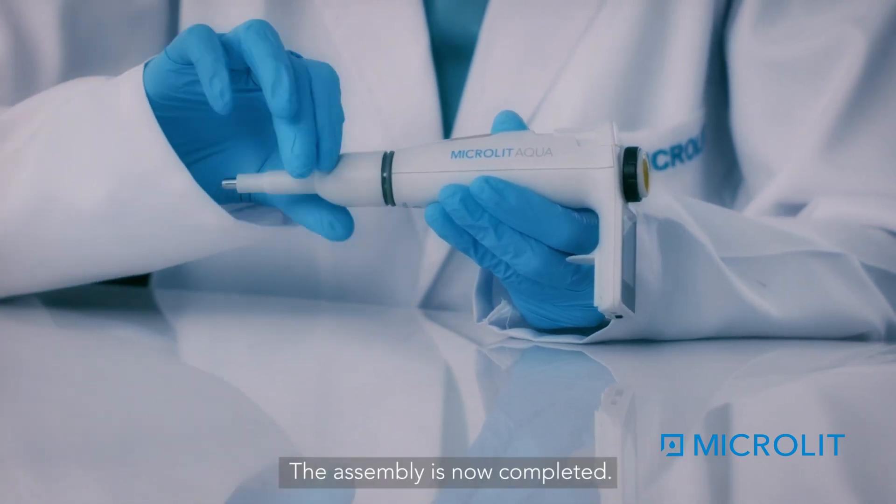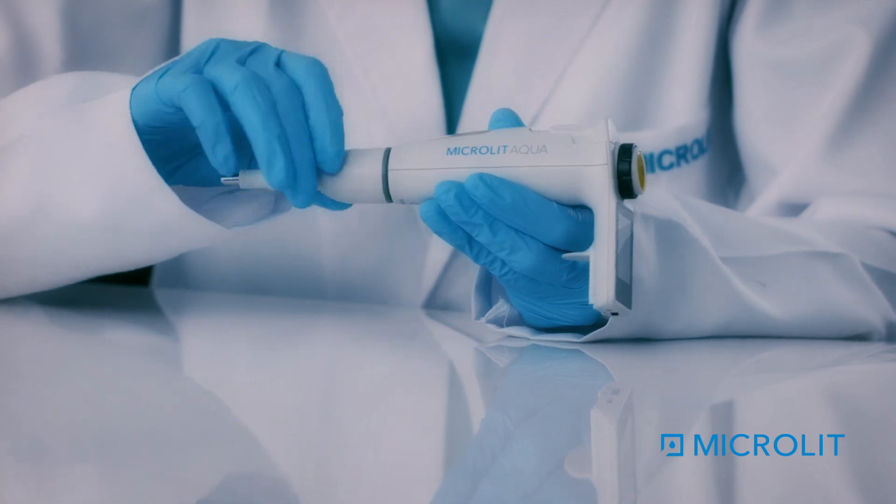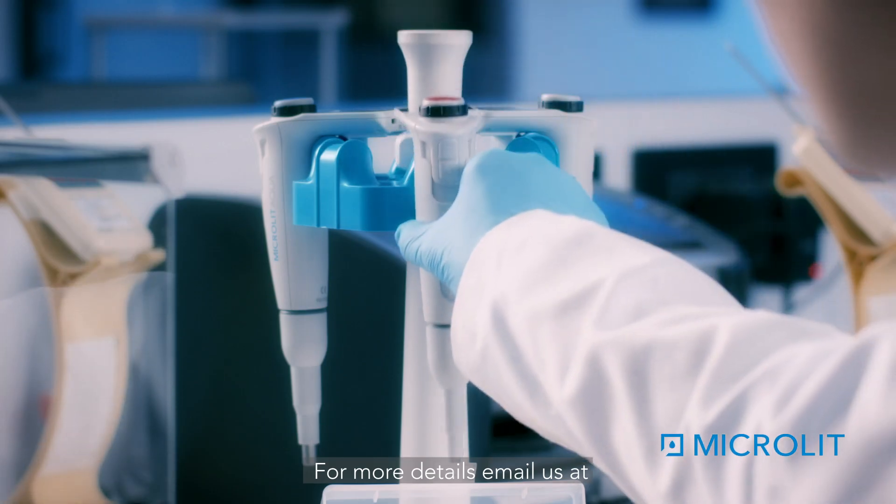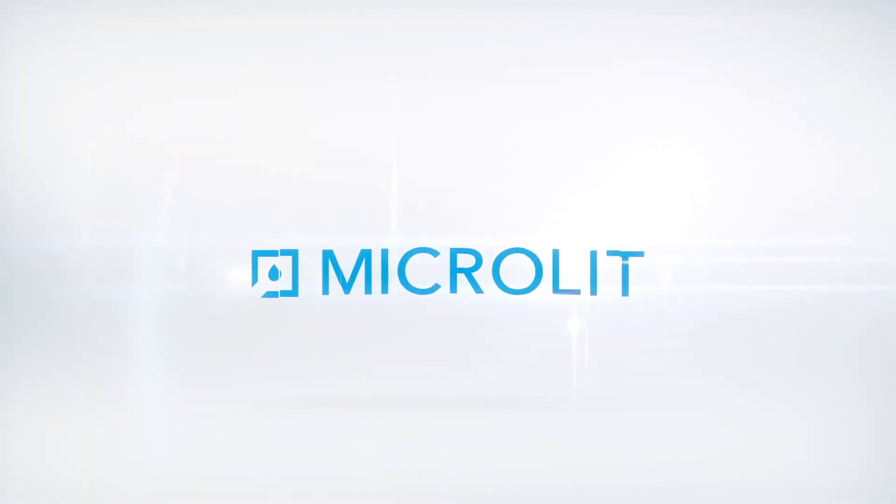The assembly is now completed. For more details, email us at info@microlit.com or visit our website www.microlit.com.